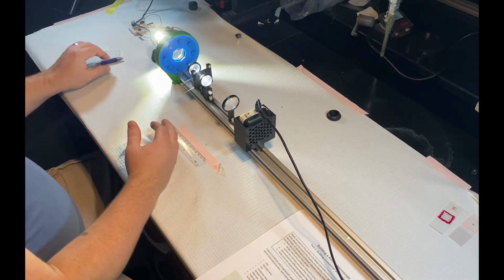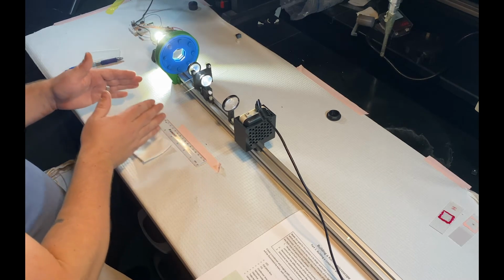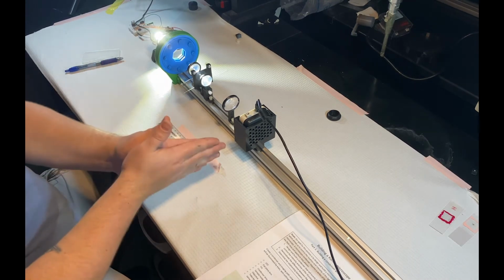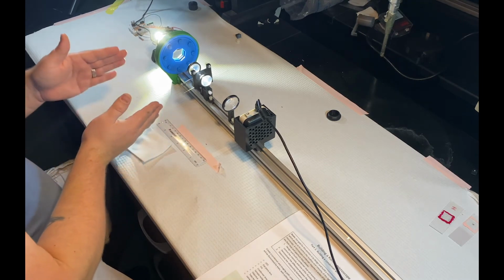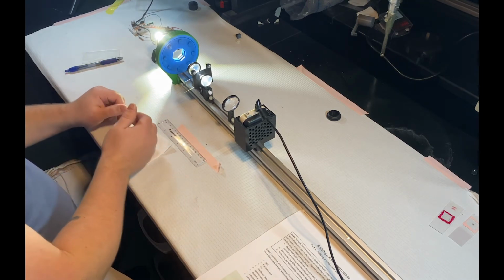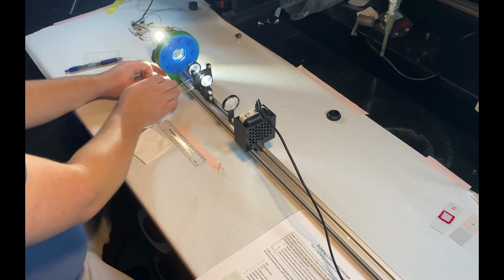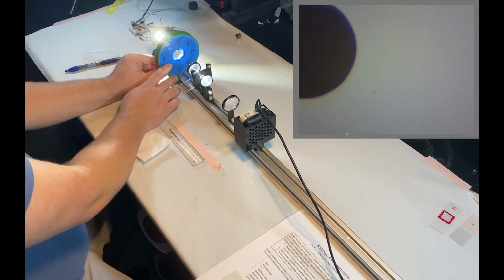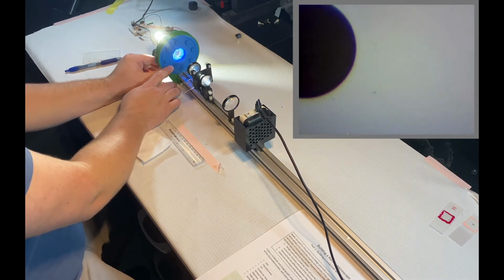And that is going to be, respectively, a plane that is conjugate to our sample plane, which is conjugate to our image plane, or one that is reciprocal, right? So perfectly out of focus. So let's just see where we are now. If I start closing my iris where I am now, let's see what happens to our image plane.